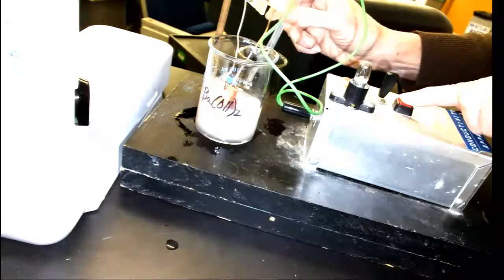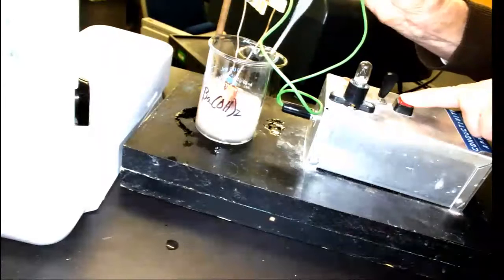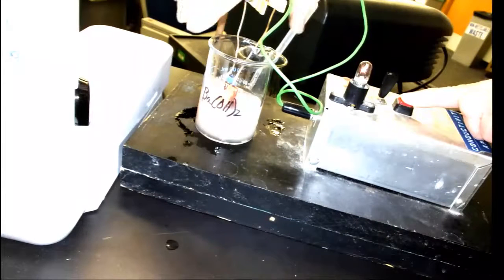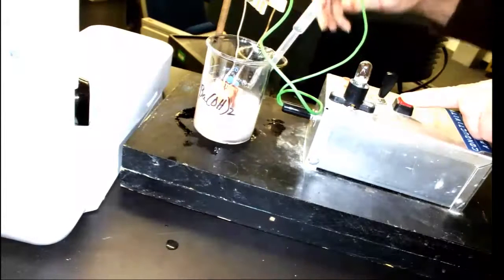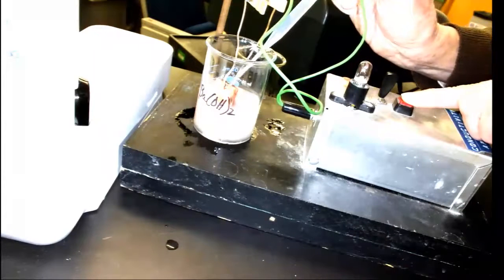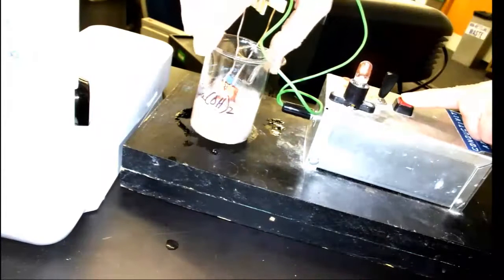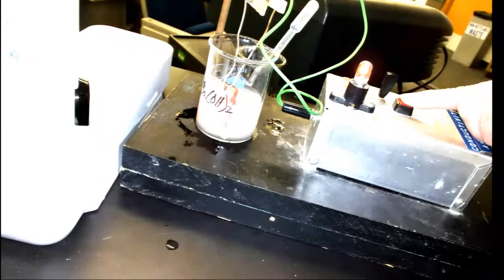What happens if I add more sulfuric acid? Well, I'm going to add some to the solution. I'll mix it up. Guess what? The light bulb's beginning to glow again, because now there's an excess of ions in the solution. Oh, maybe not quite. Wow. All right, keep trying. A little bit more. Add a little more. And the light bulb should return to glowing because there are still ions present in the solution. So I've gone past the point where all of the ions from the barium hydroxide were reacted with the sulfuric acid, and now there was none left. But after adding this extra sulfuric acid, we have ions in the solution again.